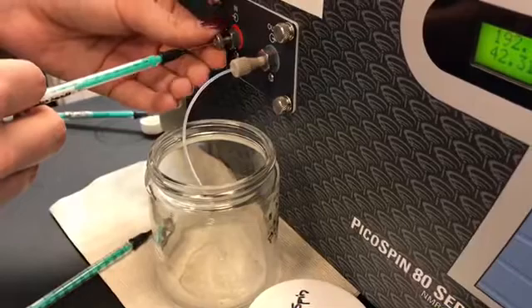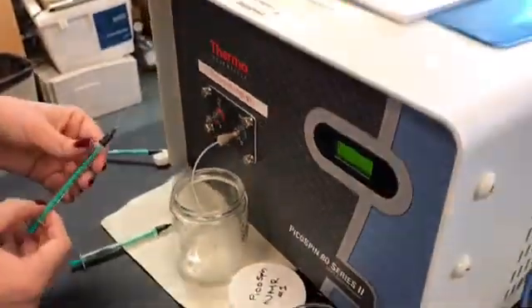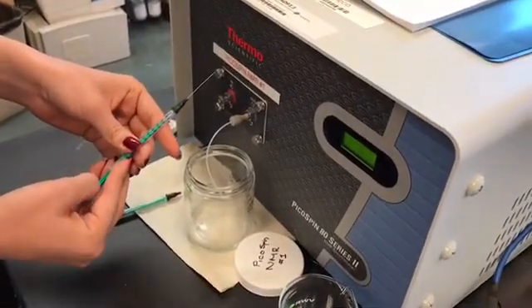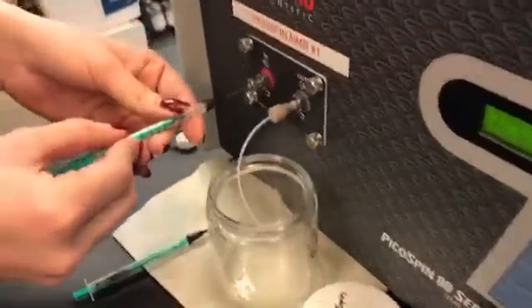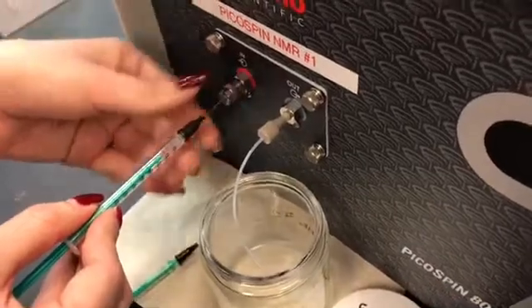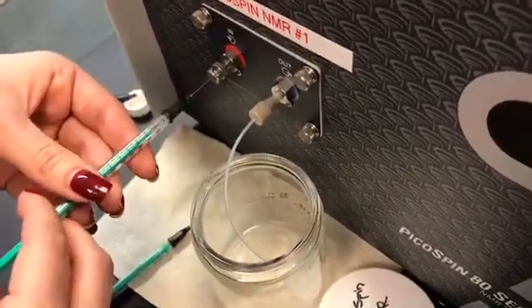Again, loosen the screw, and this time again, we're going to inject air. So, draw up 0.4 milliliters of air into the syringe, insert the syringe until it stops, tighten the screw, and slowly inject the air.